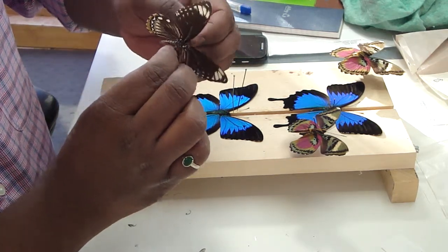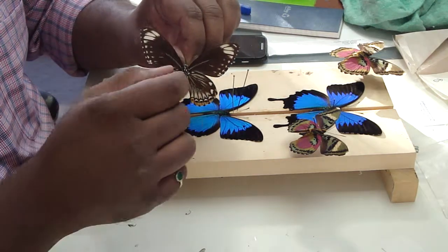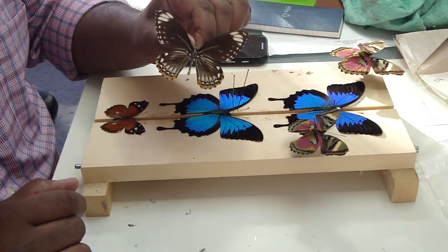And there — put the pin right back through. Pretty simple, but it takes lots of practice. The most important thing is to hold onto that thorax.